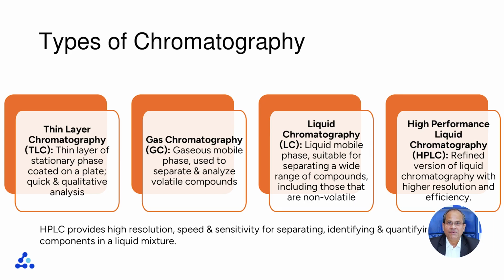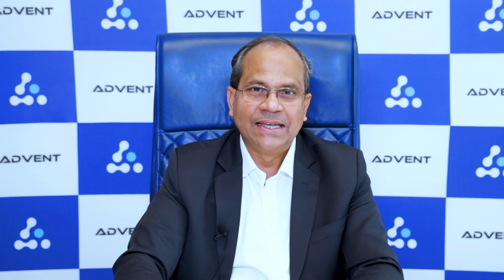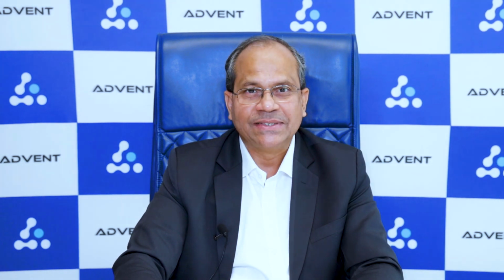HPLC is particularly valued in research, industry and quality control for its precision and efficiency. HPLC has several variations and advanced forms, including related hyphenated techniques that are tailored for specific applications and performance improvements, each with its unique setups and capabilities.